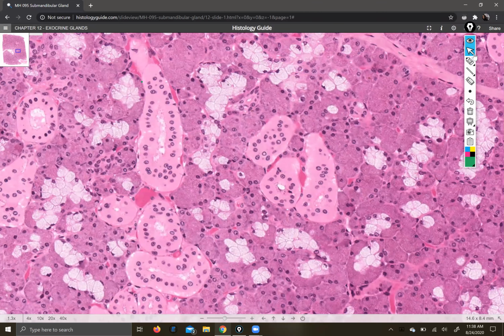All right, so we've got sort of three classes of cells and of colored things here. So we've got these light pink guys with very obvious nuclei. We've got these darker guys that are arranged in clumps. And if you look closely, you'll see that the clumps of cells, the nuclei tend to stay away from the middle of the clump, so they're all at the edge. And then finally, I have these sort of lighter colored ones here. So those are the three things you're dealing with when you look very, very closely at the salivary gland.